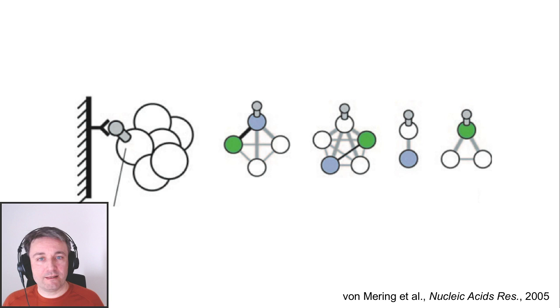That was my first idea. I tried that. It turned out to not be a very good scoring scheme. You could do other things. You could calculate an observed over expected ratio. We know which fraction of pull downs contain the blue. We know which fraction contains the green. That means we can calculate which fraction we would expect by random chance to contain both, and we can compare that to the actual fraction that contains both. That turns out to be a better scoring scheme.